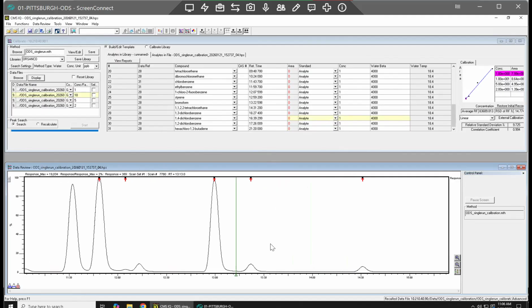So yeah, for instance, this section, well, this is a small peak, but it does have a cross above it. So that probably is a true peak and not just background noise in the chromatogram. So we'll go ahead and call that one as well. So 1431. So that's my 1122. Next one here, 1322, bromoform, and then going over 1259, styrene.